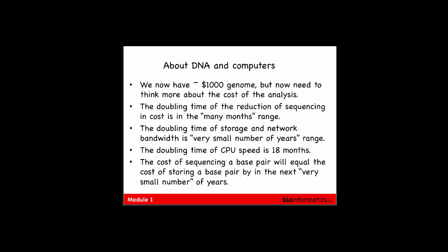And so that if you need that sequence again, that should be your backup. It should be that DNA sequence in the freezer. Sometimes it's possible to do that. Sometimes you're sequencing samples from a cell line, for example, and so you have lots of DNA. But sometimes you're dealing with tumor samples or rare environmental samples, and so you don't have access to DNA all the time. So you do have to store the DNA sequences and keep them around. But it's something to think about.